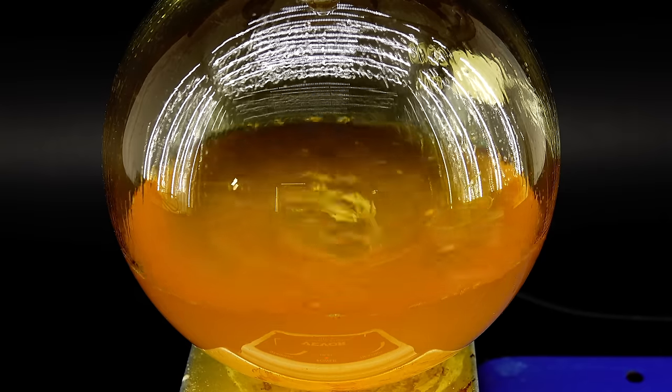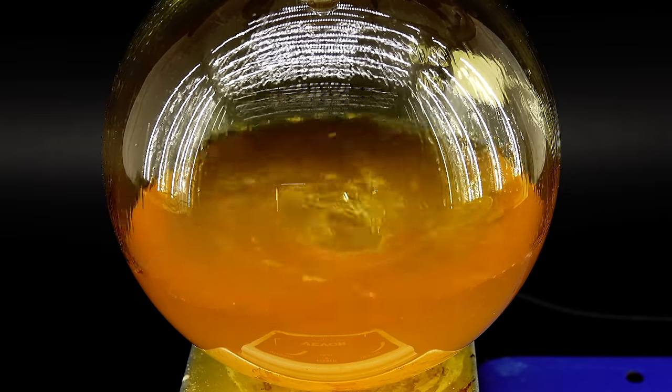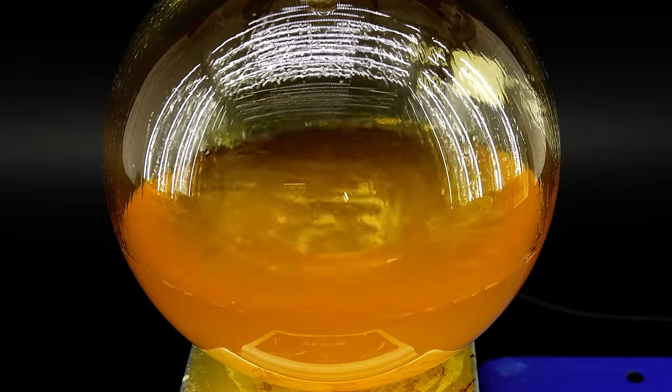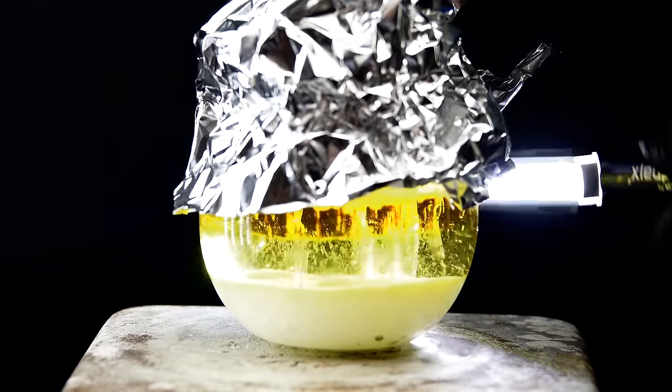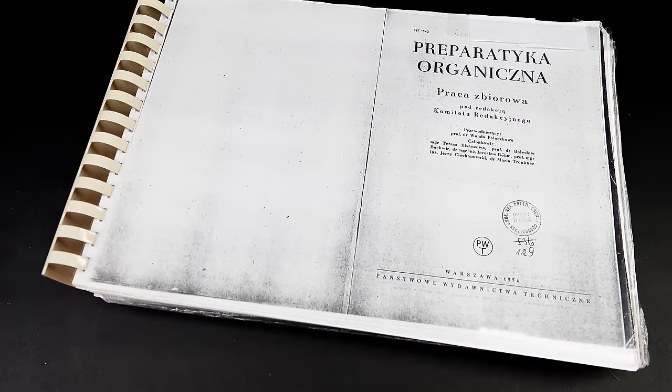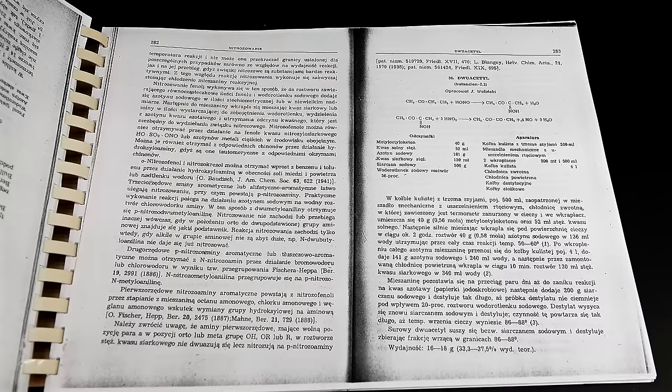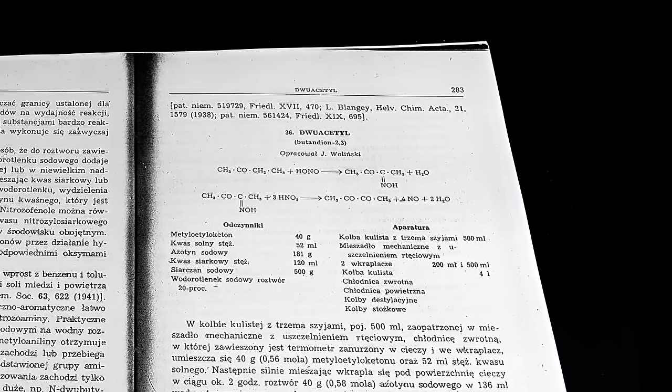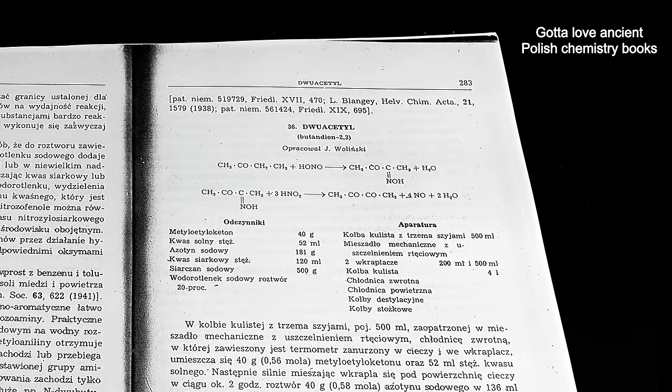Based on all this cool information I decided that this is exactly what I want to make. However, this was the easy part since in the articles about it I couldn't find any accessible method of making it. I was really worried that this project would be nipped in the bud by the lack of synthesis information, but fortunately when one day reading through this gigantic copy of a 1954 Polish chemistry book I somehow stumbled upon the exact procedure I needed. What's even more fortunate is that it seemed quite straightforward and started from an easily accessible paint stripper chemical, all of which made me really hyped about making some deadly chemical butter.